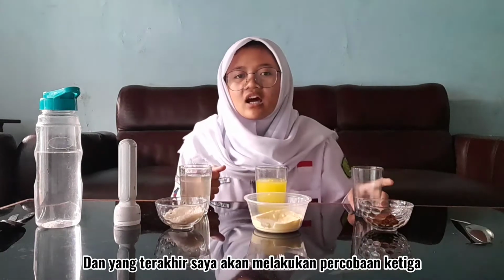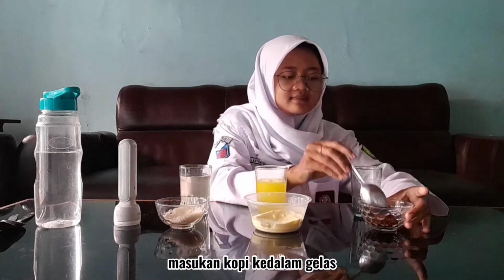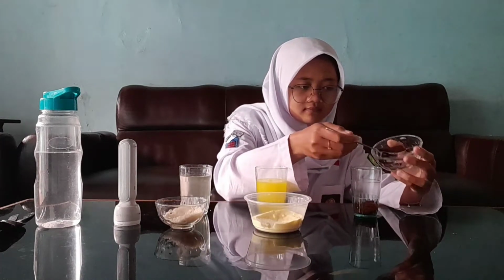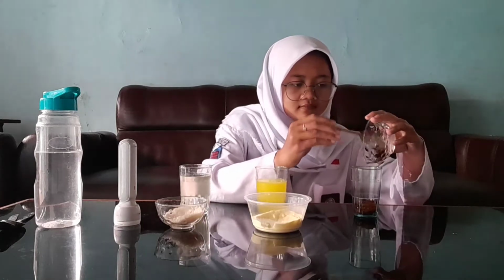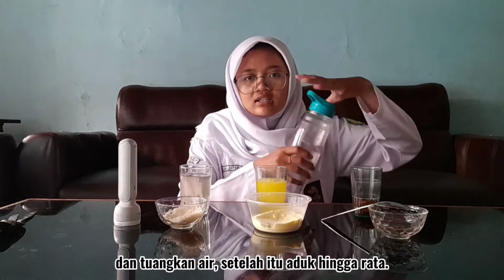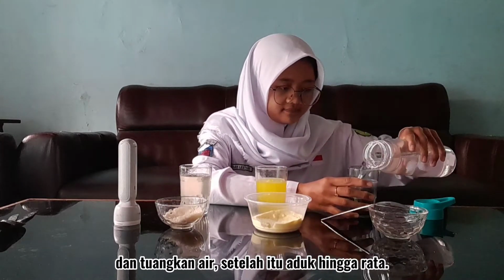And finally, I will do the third experiment. Put the coffee in a glass, and pour water and then stir until blended.